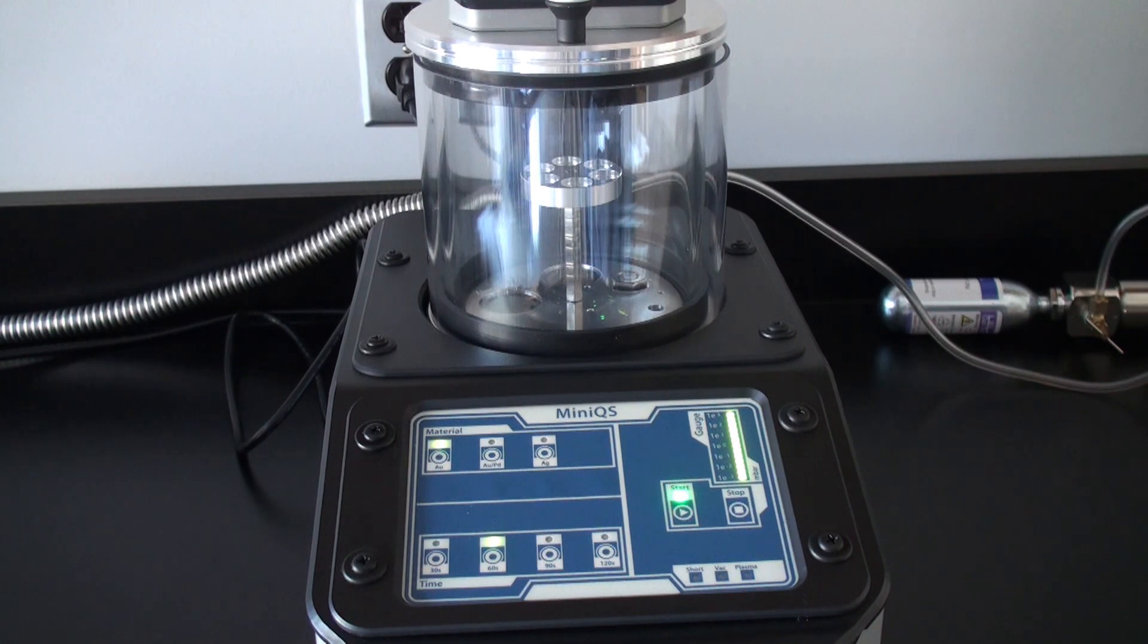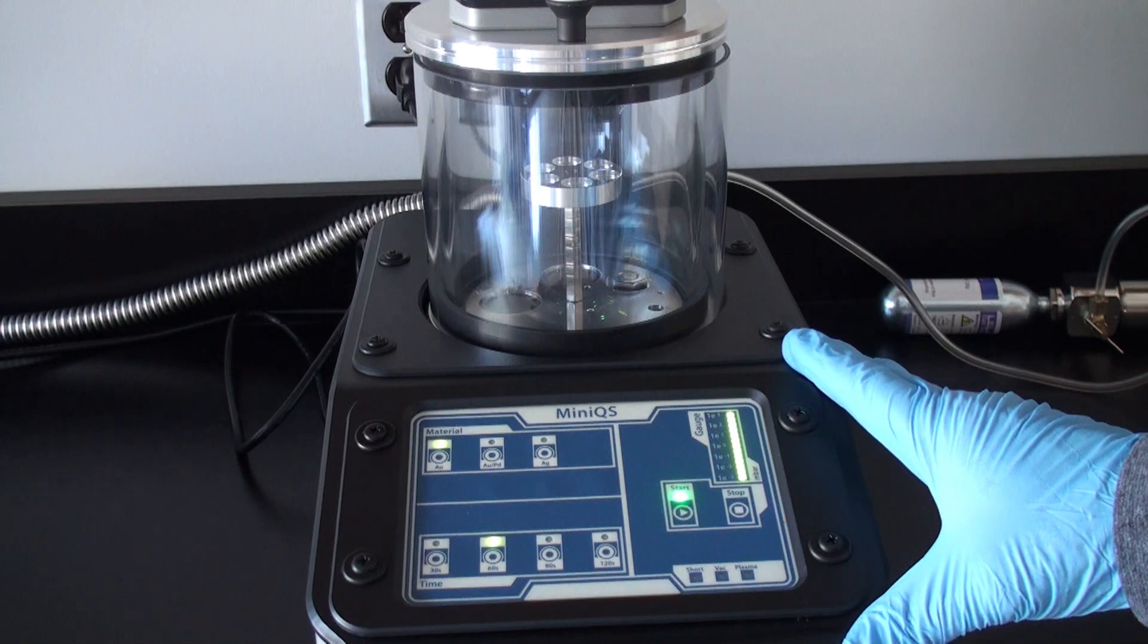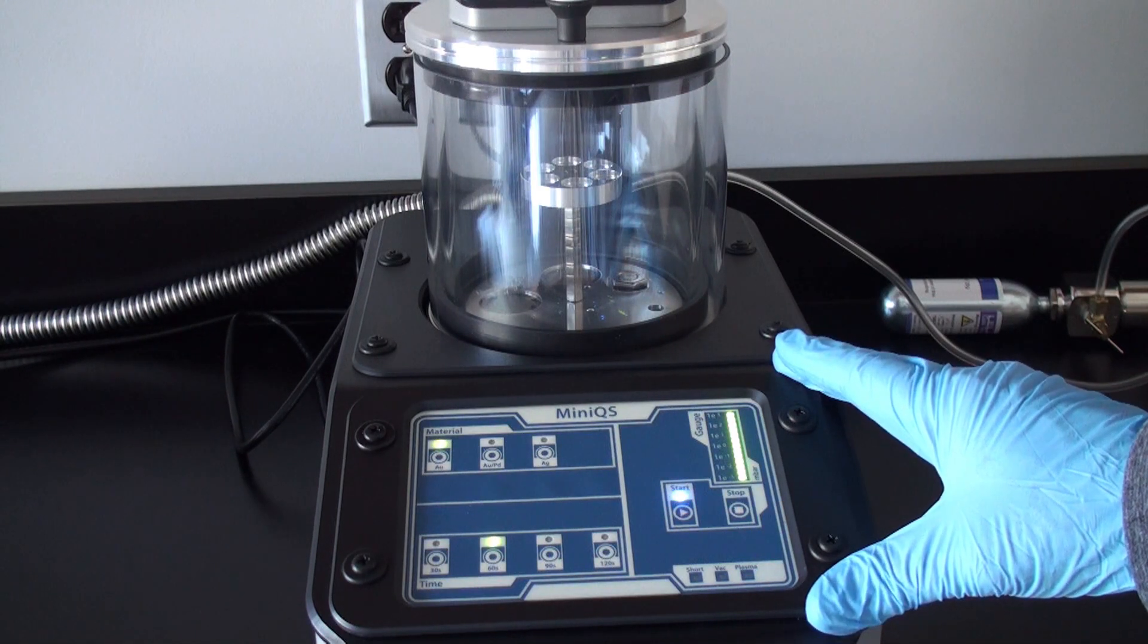The system automatically will shut down and vent once the sputter process is complete. And there you have it, the MiniQS is a nice addition to the Q coder product line that we distribute here at EMS.